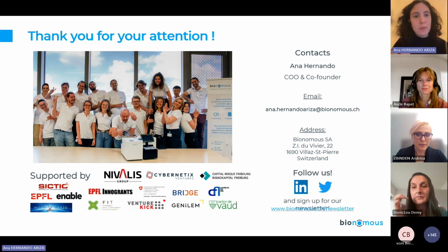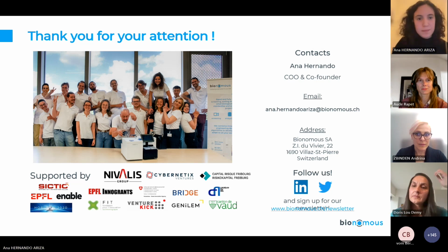There's a bit of mechanical, it can happen that we lose maybe some eggs, but this is something we're improving, and it's really less than 5% of the eggs. And then it can also be the software, but we're currently improving it, and what we want to reach is 99% accuracy. Okay, thank you very much.